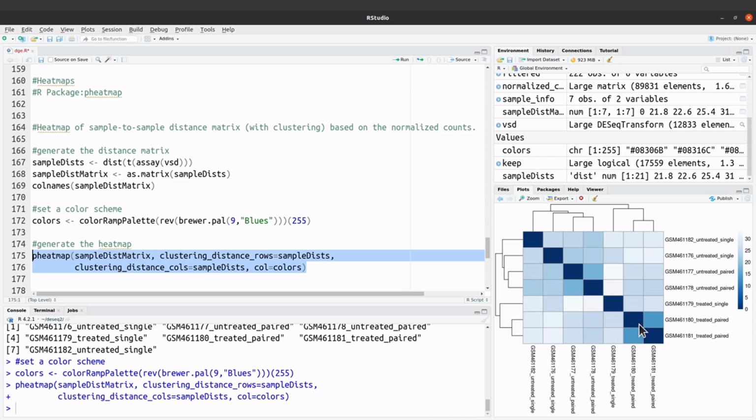So in this particular image here, in this plot here, the dark blue that we see here means a shorter distance. So that means as the color approaches this side here, it's a shorter distance. So the shorter distance means what? High similarity. That's what it means. And so once you have this color scheme, it becomes easy to interpret what you have here.